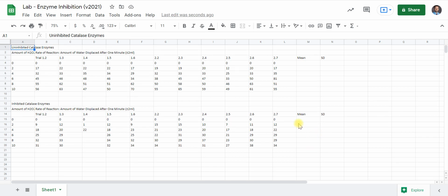This is Mr. McGee. We're going to make a tutorial here on the enzyme inhibition and substrate concentration lab that we did on Wednesday, August 26th. If you were not here, please make sure you read the lab sheet, which I'll include on Canvas. But otherwise, what we're going to do is make a tutorial and show everybody step by step how to make a proper table and a graph, and also how to do a statistical test from this.